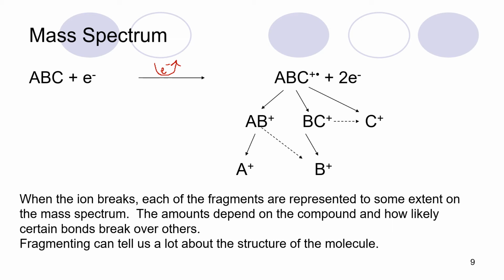And then we have the cation radical, which is the complete molecule just losing an electron, and it's positive. And so again, that's why it's detected, because it can go through the magnetic field. If it wasn't charged, it would just get lost in the instrument and not be detected. But then you can see here that if it's unstable, it can also break apart into its smaller particles.